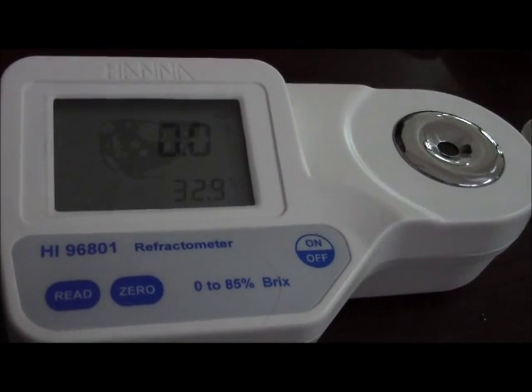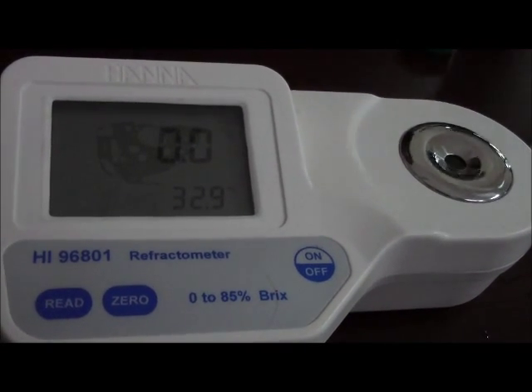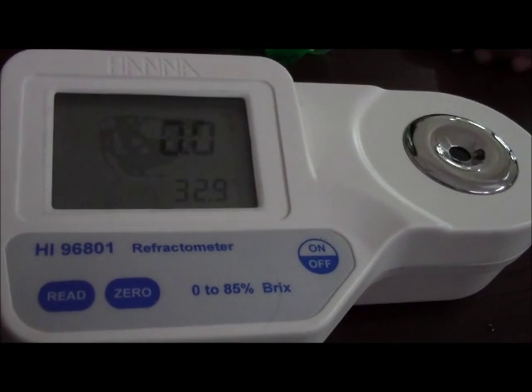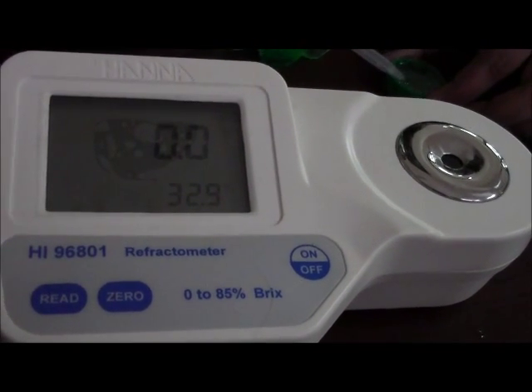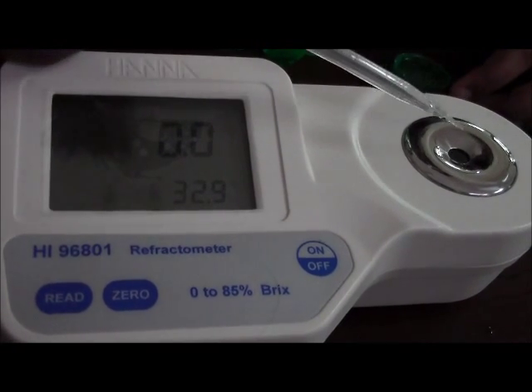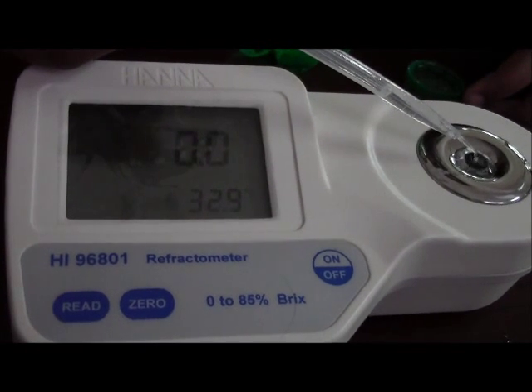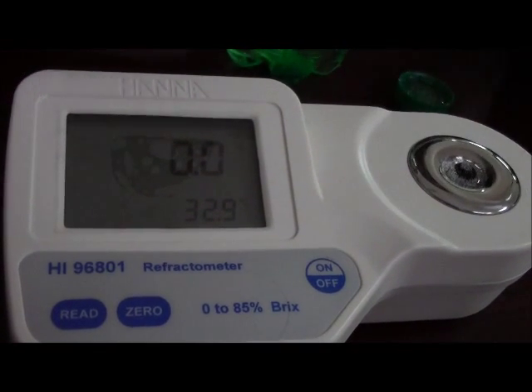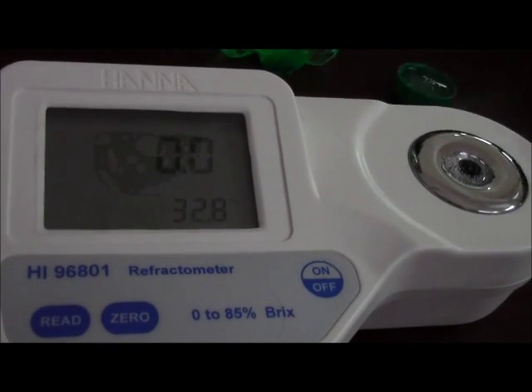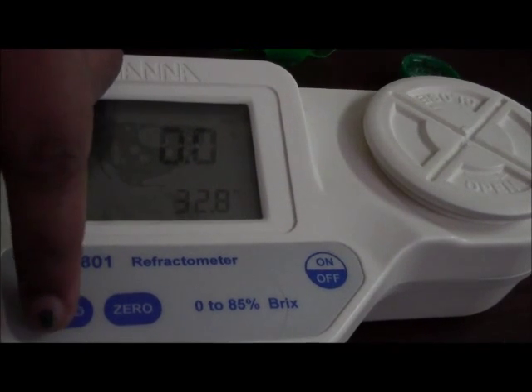In order to check the efficiency of your sample, we are testing the meter using a 7up solution. Take a few drops of 7up, cover it with a lid, and read it.